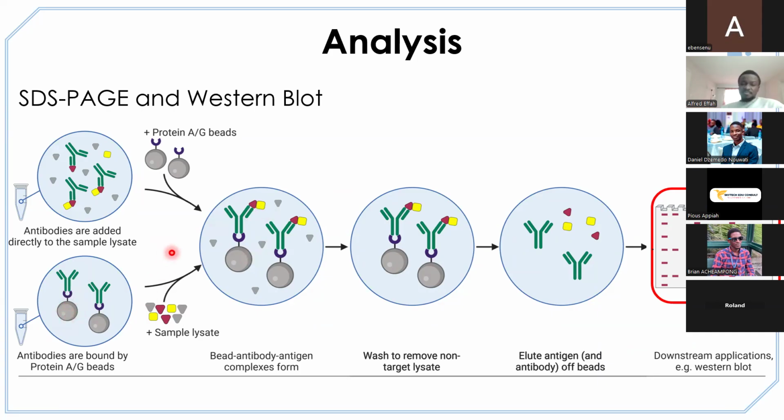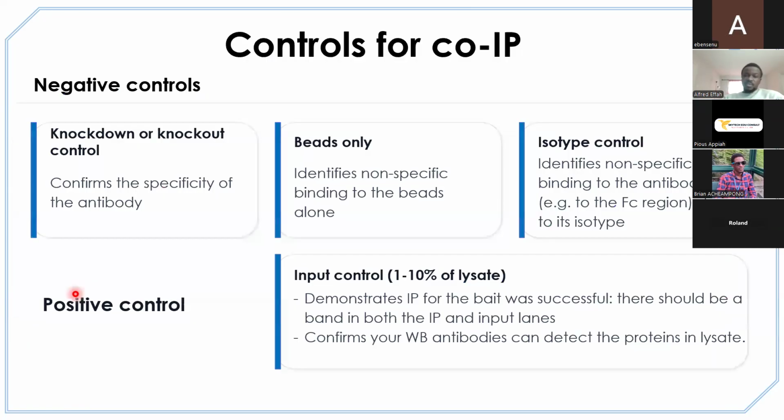If the bead starts binding, then it tells you that there was non-specific binding that was coming from the bead and not the antibody, which rules out that there's no interaction. There was something else that was interacting, which was incorrectly picked by your bead. And so the main goal is to make sure that you had everything on point. Okay, so that is one way we can do.